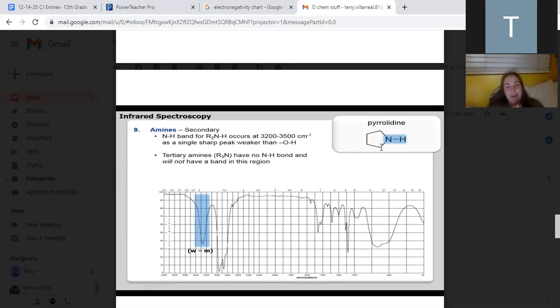This is what IR does. It tells you things that are there. You just don't know exactly where. You just know that it has an OH, there is a carbon double bonded to oxygen, it has sp2. It's the first piece of the whole process.